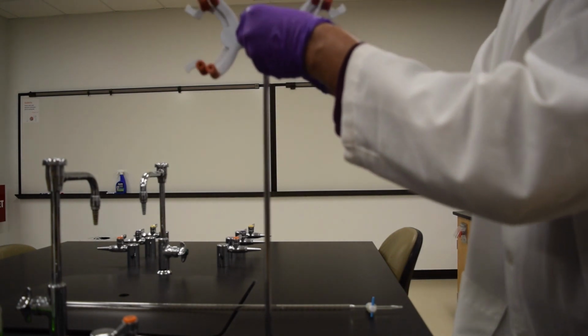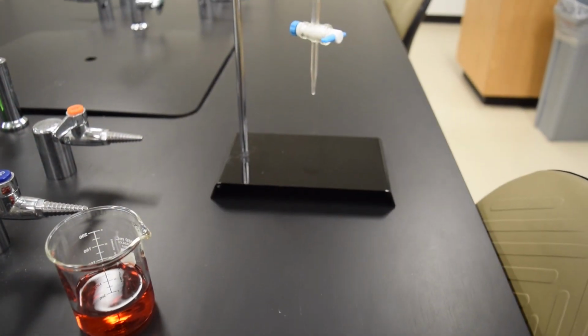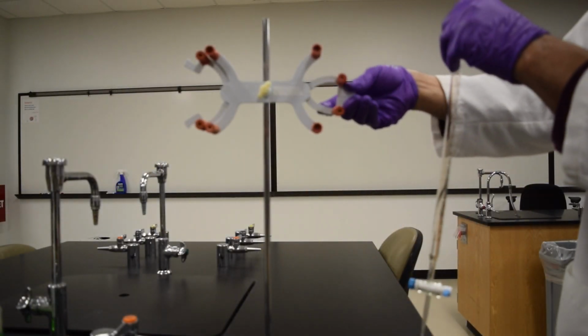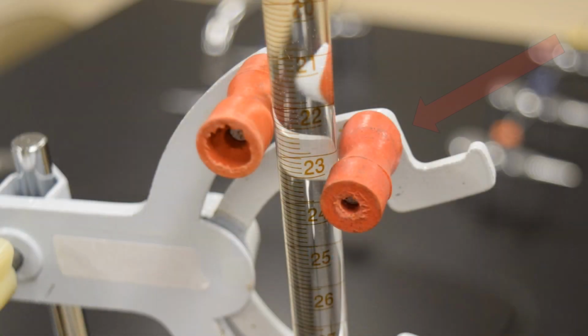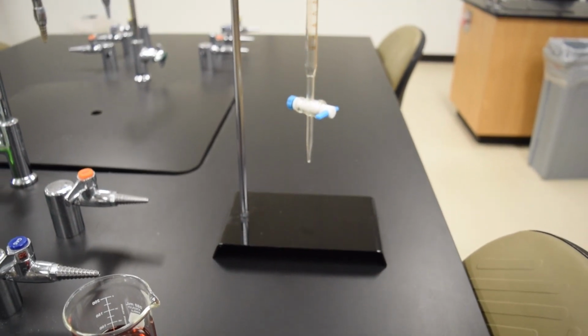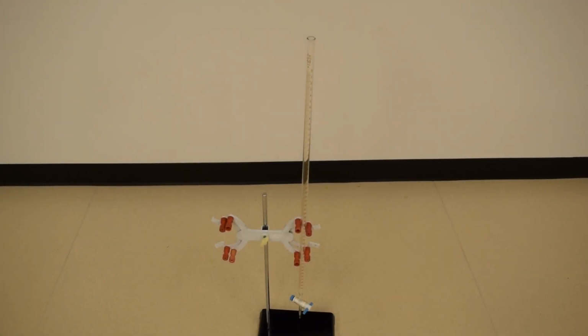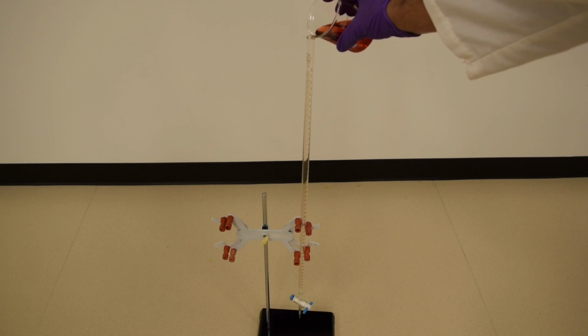Attach a buret clamp onto a support stand. A support stand is a metal rod attached to a heavier metal base. Open the buret clamp and insert the buret into the clamp. Make sure the buret is placed in the rubber grooves as seen here. It is customary to place the support stand with the buret on the floor. Make sure the stopcock on the buret is closed. Then add your liquid from a beaker.